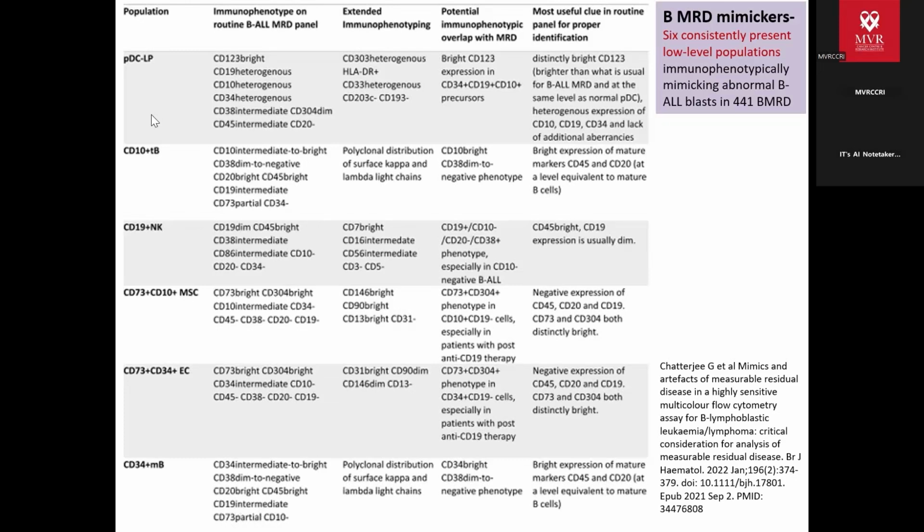And then finally the impression, that is, it will reveal dash percentage of abnormal B cells in an acute lymphoblastic leukemia case. And do read the comment also, don't just see the percentage and rely on the report. Do read the comments, whether it is dilute. So these are the optional comments which will be given according to the sample.